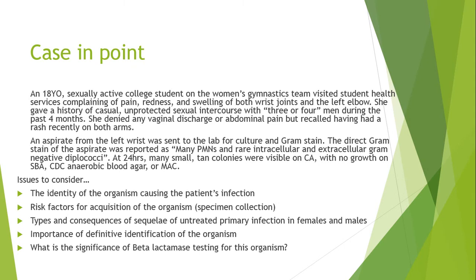Something else is this intracellular and extracellular gram-negative diplococci. That's a notorious gram stain for Neisseria gonorrhoeae. So based on those characteristics, that's the identity of the patient's infection. What are some risk factors for acquiring this organism?